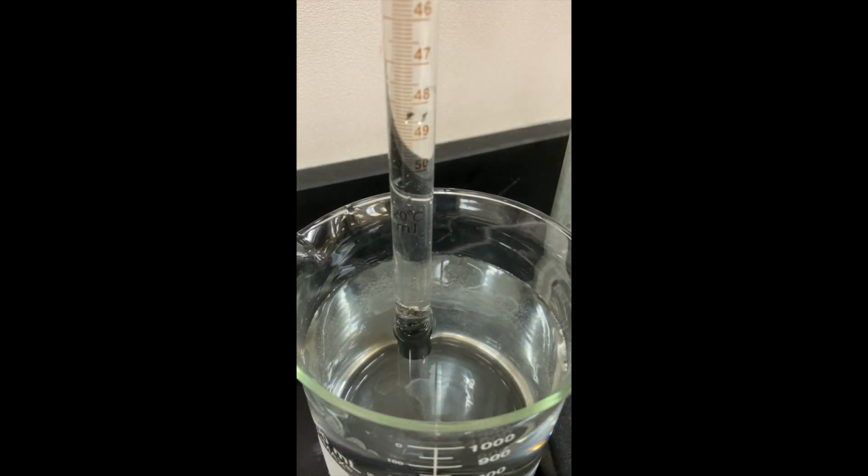All right, the hydrochloric acid is now making its way down to the magnesium ribbon. You will see hydrogen gas being emitted when the two connect and the reaction begins. Another thing to point out is that the rubber stopper has a hole in it, so as the gas is collected and displaces the water, the water can flow out into the beaker.